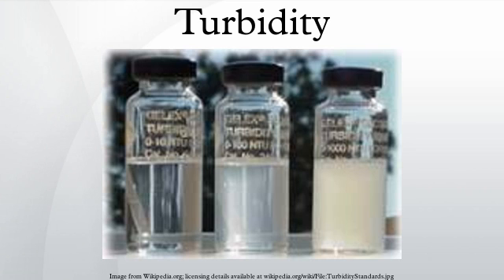The propensity of particles to scatter a light beam focused on them is now considered a more meaningful measure of turbidity in water. Turbidity measured this way uses an instrument called a nephelometer with the detector set up to the side of the light beam. More light reaches the detector if there are lots of small particles scattering the source beam than if there are few. The units of turbidity from a calibrated nephelometer are called nephelometric turbidity units.